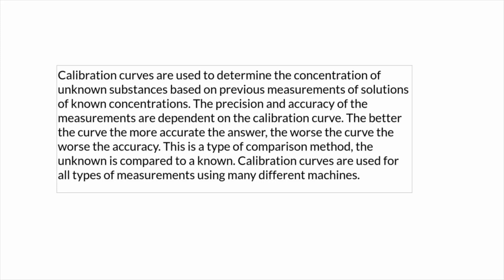Okay, hello everybody. Today we're going to be talking about the lab where we're going to be working with a calibration curve. On this slide, I just have this big definition that I copied from a website. Basically, calibration curves, I'm going to read through this and discuss it as we go along, are used to determine the concentration of unknown substances based on previous measurements of solutions of known concentrations.